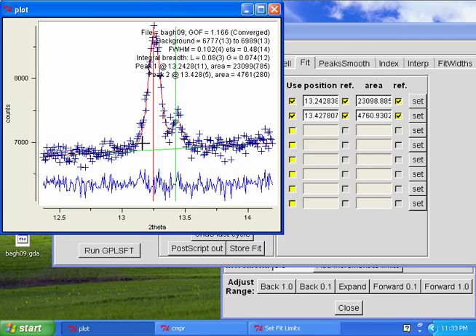We could put low angle asymmetry into this, but to be honest, I don't think we need it. There really isn't a whole lot of sign of a low angle asymmetry. And it's converged, and those peaks are about as good as it's going to get.